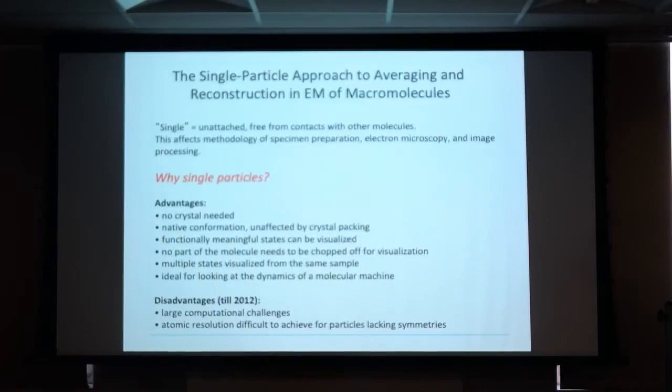The disadvantages up to 2012 was that there was a large computational effort, and atomic resolution was difficult to achieve for particles lacking symmetries. Well, that's all wiped out. This entire problem was wiped out with the advent of the new camera, these fantastic cameras. They became commercially available in 2012, and they are able to detect single electrons. They have a superb signal-to-noise ratio, very superior to film.